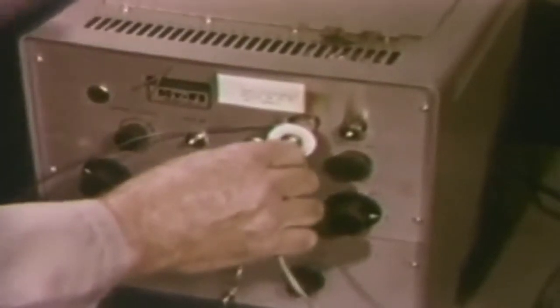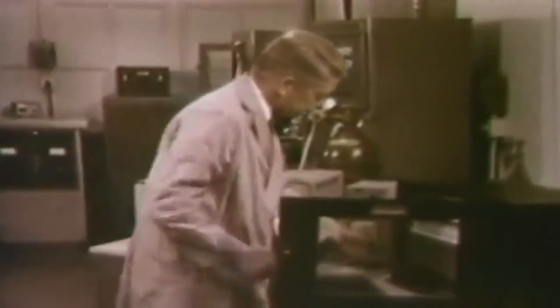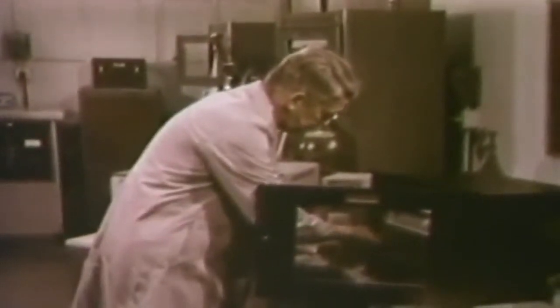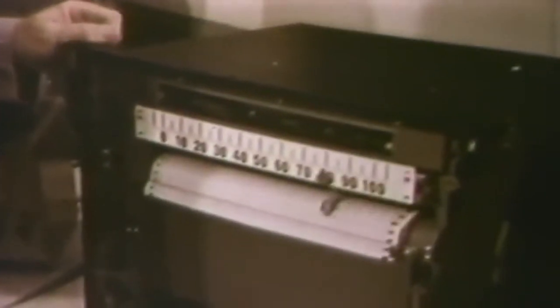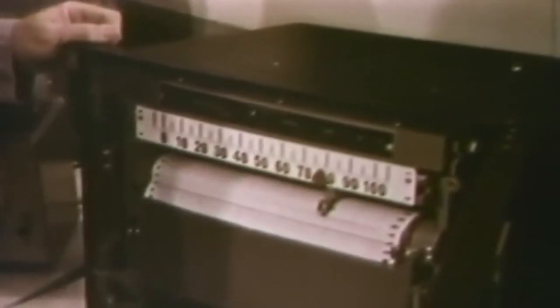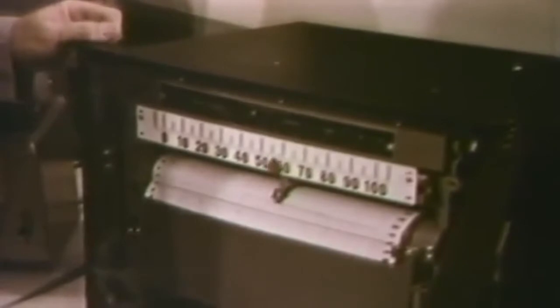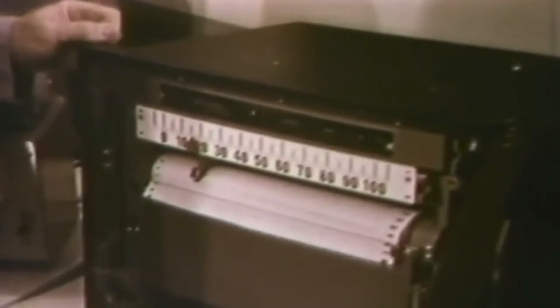The vaporous fractions are quantitatively and qualitatively analyzed by being carried through a specially packed column by nitrogen gas. The resulting readout can identify the vehicle in which the pigment of the paint sample was suspended: linseed oil, acrylic, or others. If this differs between known and questioned sample, the examination would end with a negative report. In this case, results prove to be identical.